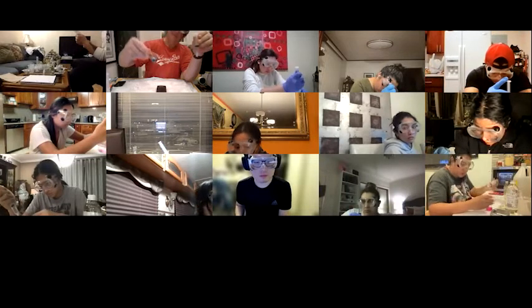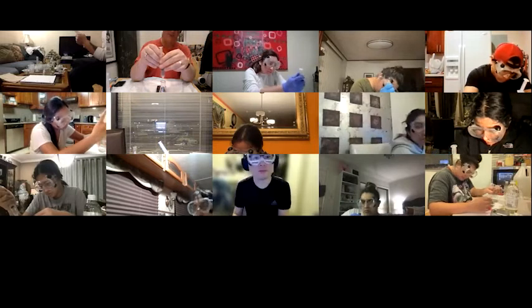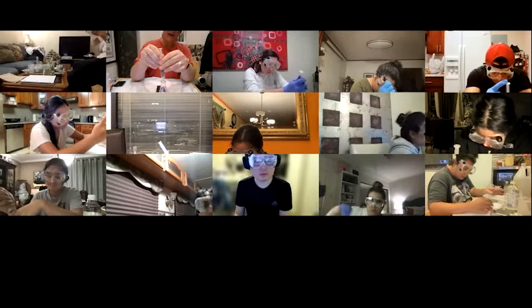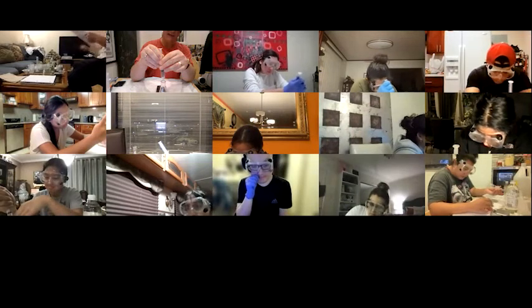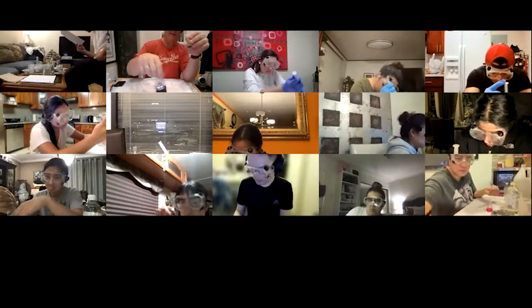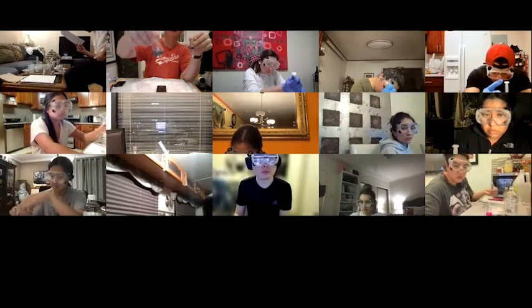Maybe more snuck in that last drop because I wasn't seeing anything for the longest time. Yeah, it's going to be practically impossible to get it that light pink I showed you. And that was with a burette.